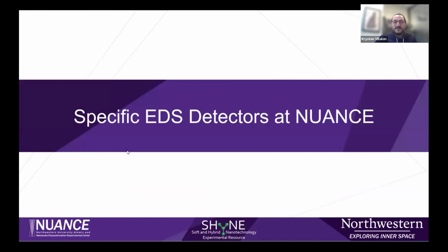All right, and that's all there is to it. So now we have our spectrum that we can analyze. But since we just finished our crash course on our EDS detectors, let's go ahead and take a quick look at some of the EDS detectors that we have here at Nuance.